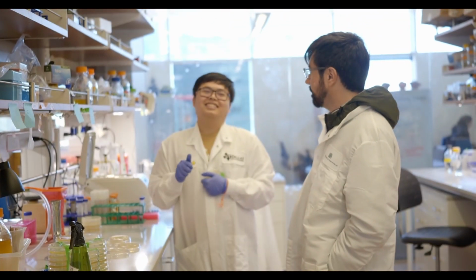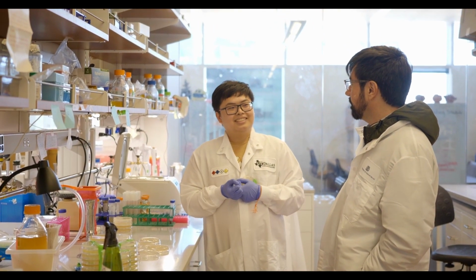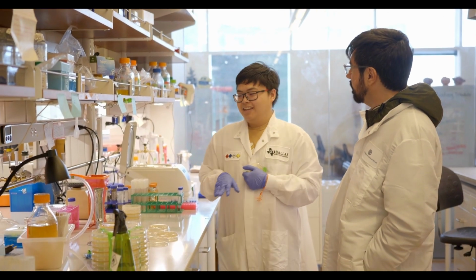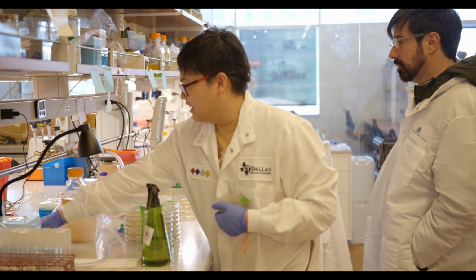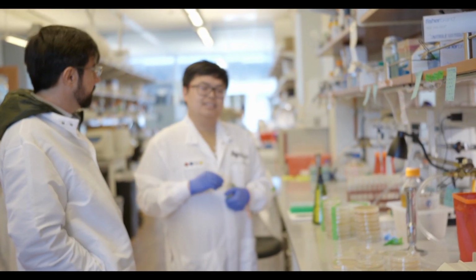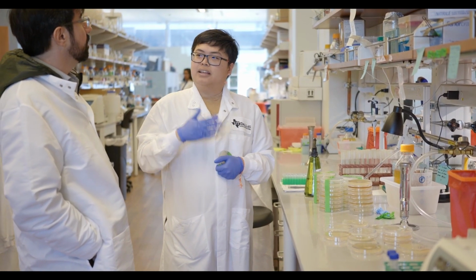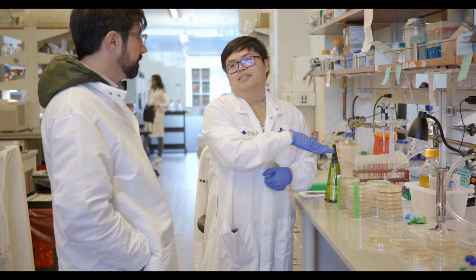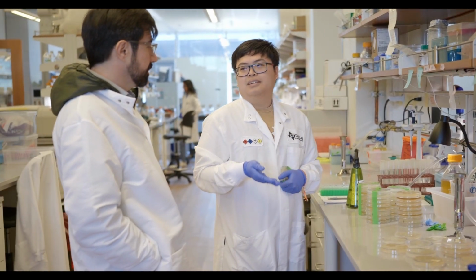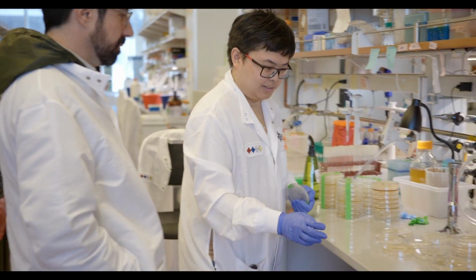Yeah. A little side thing I'm also doing is I want to see if I can get bacteria to produce some pigments, just to see some colorful bacteria. And how I've been doing that is I just left the light on here. Pigment production in bacteria functions as a barrier to light, like UV damage and things like that. So by growing them under the light, I might be able to induce bacteria to produce pigments as well, so we can see some colored ones.